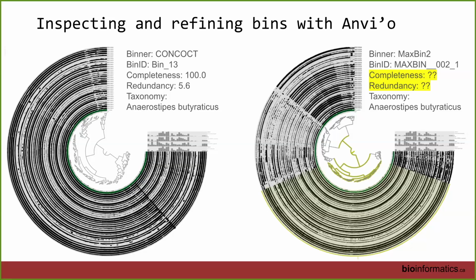It's a population genome. Yeah, so this is a bin, and it's a population genome. And so both of these are population genomes. One is parts of multiple, maybe strains, perhaps. They are both being identified as the same microbial species. And so the likelihood is that there's multiple strains that have different abundance profiles depending on what sample they're in or where they're. Each of these would be considered a single MAG, made by two different processes.